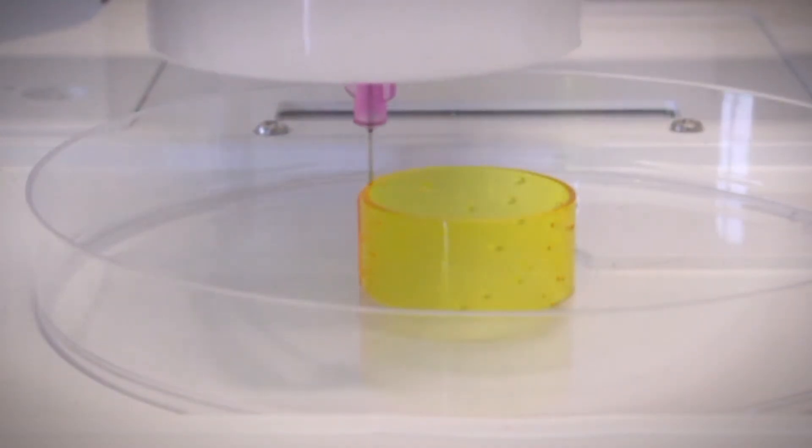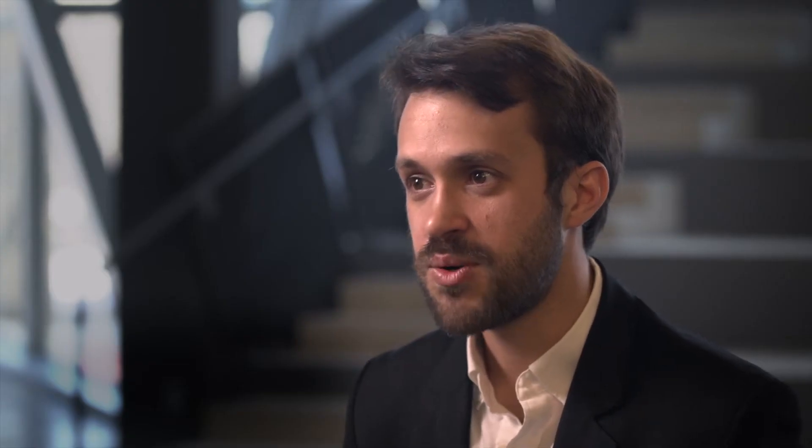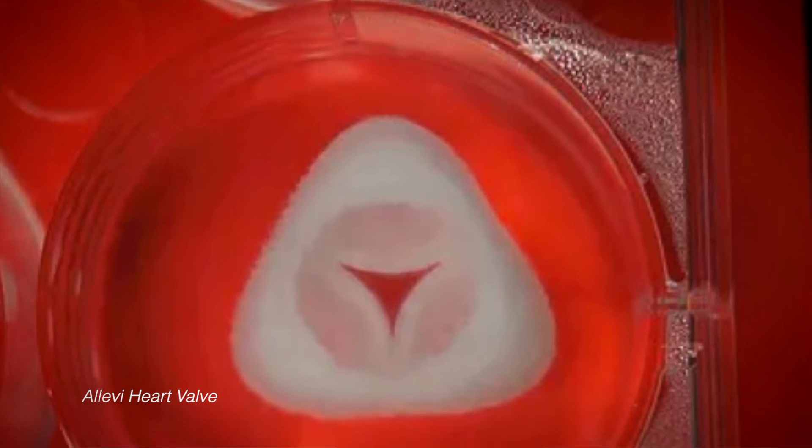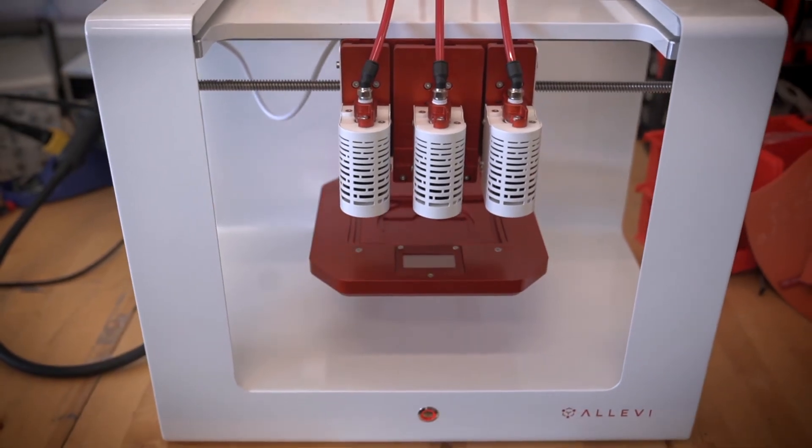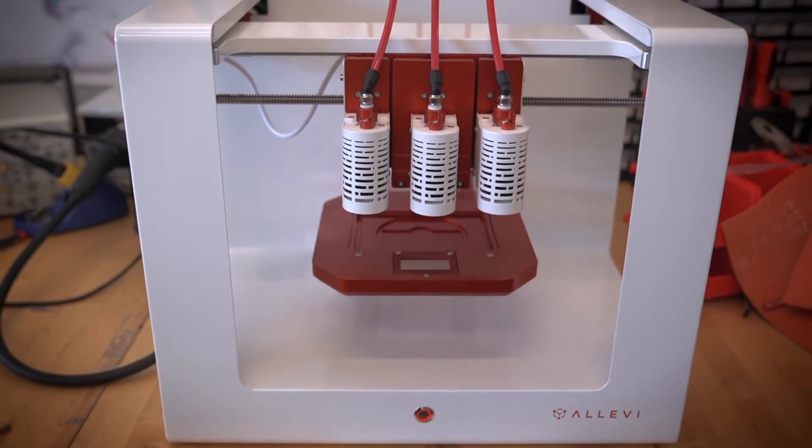In the long term, I hope we can begin to create simplistic organs, whether it's bones, bioprinted kidney patches, that can begin to support the specific organs as they begin to fail, which I think will be very exciting.